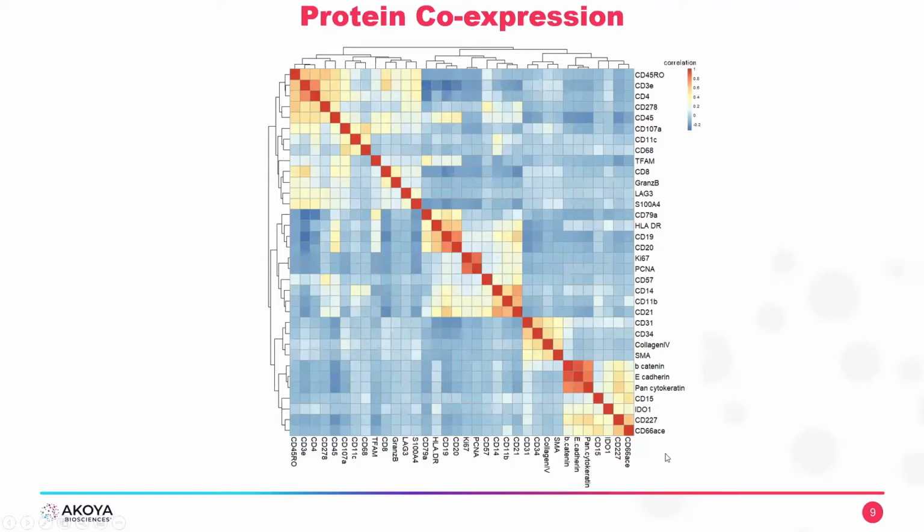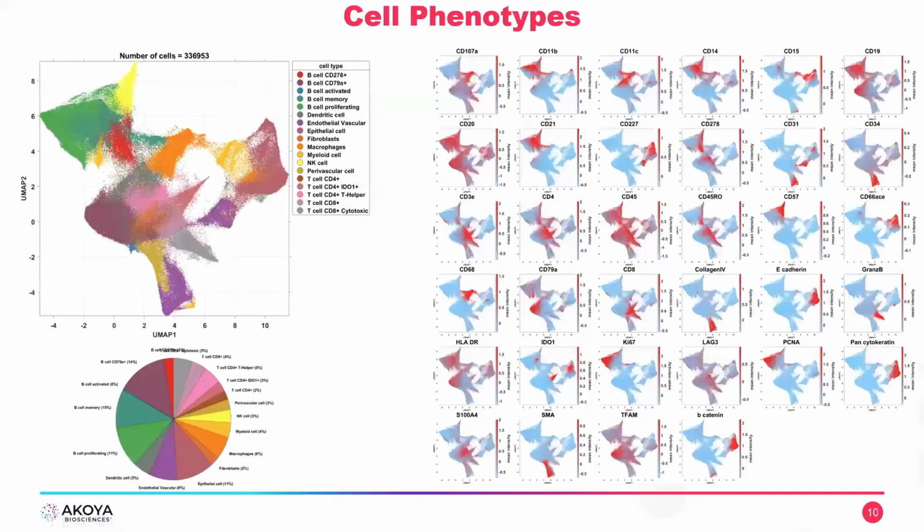These are real Codex data, about 350,000 cells in a tonsil. Cross-correlation works really nicely. The T cells up here, the vasculature here, you have B cells here, epithelial cells. This is one way that you can analyze your Codex data. Now, of course, and I've just already shown you some clustering runs, once you have your data analyzed, once you have the QC done, and you think that your expression patterns are looking good, you can cluster your data.